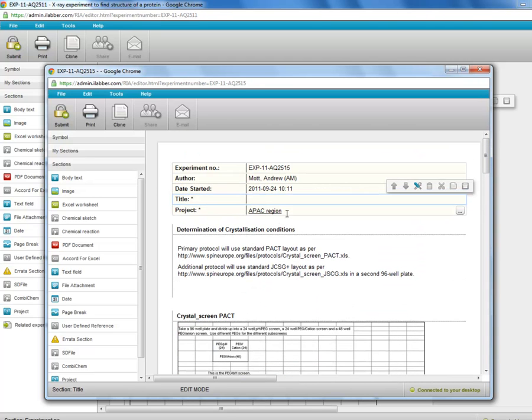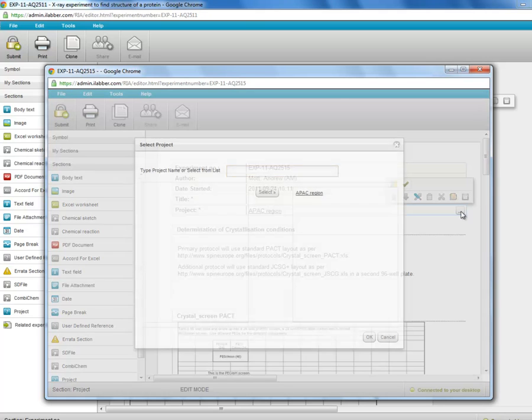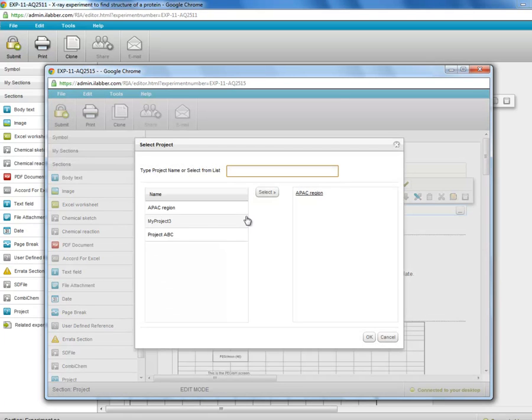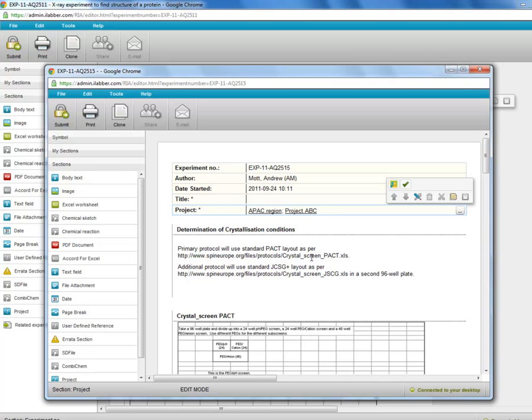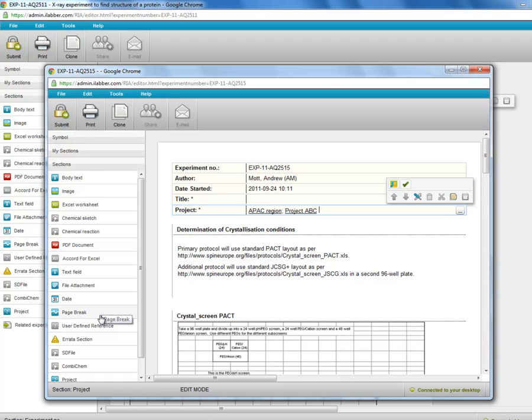Of course we can change the project if we want to. And we can edit the sections, add new sections using the section toolbox or delete sections. So that enables us to reuse an entire experiment.